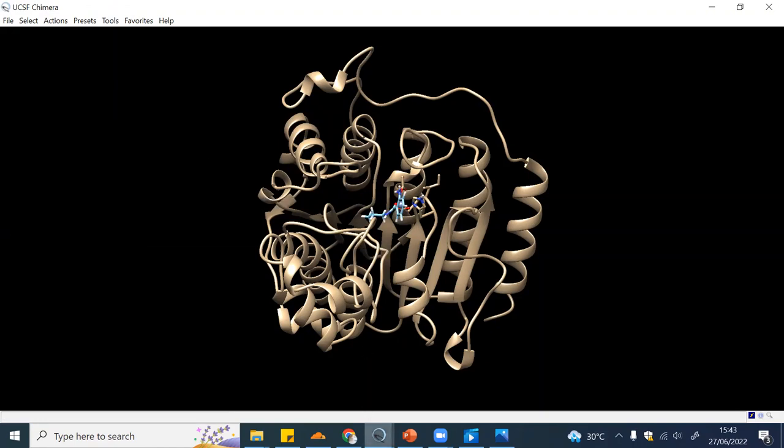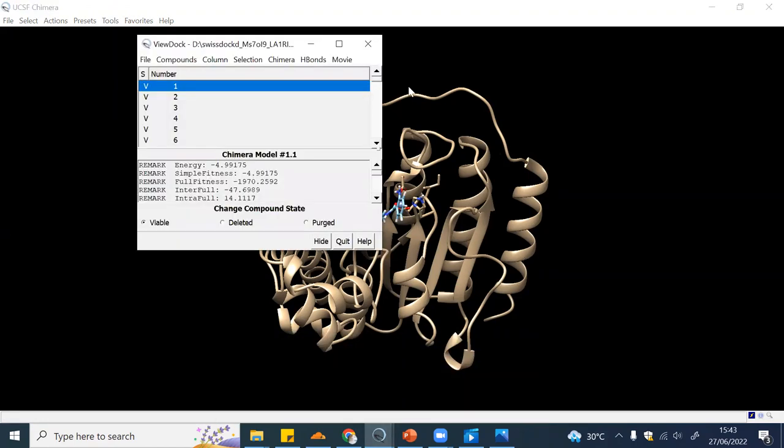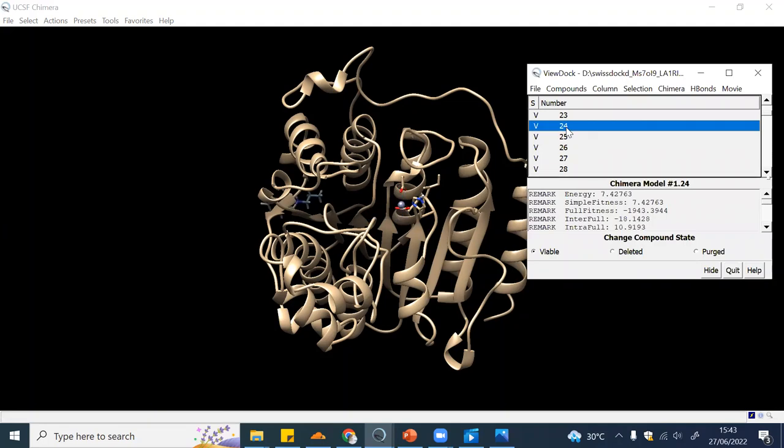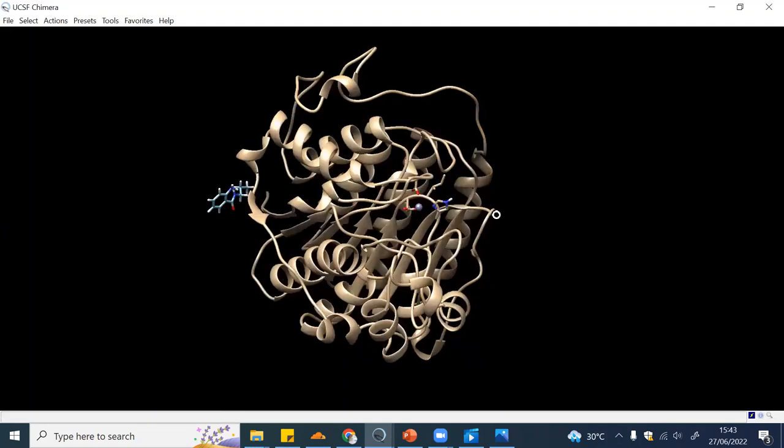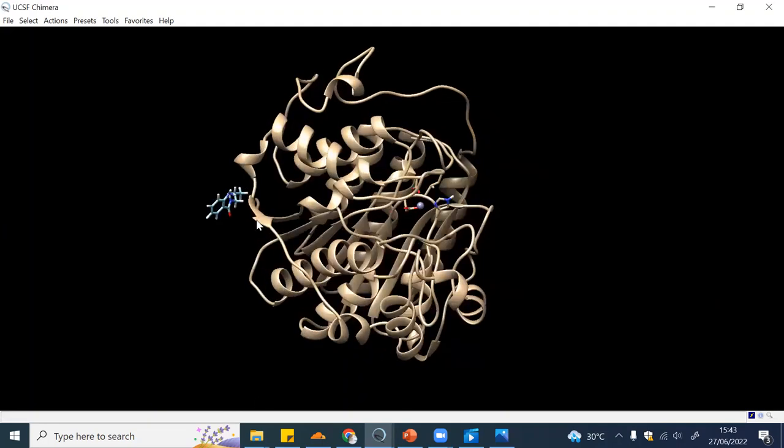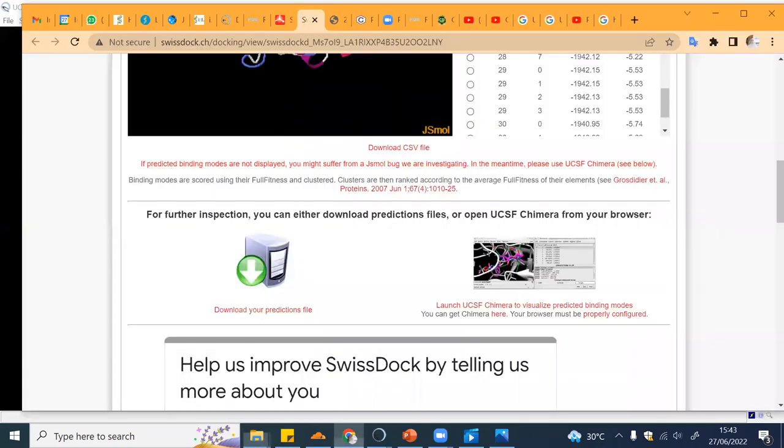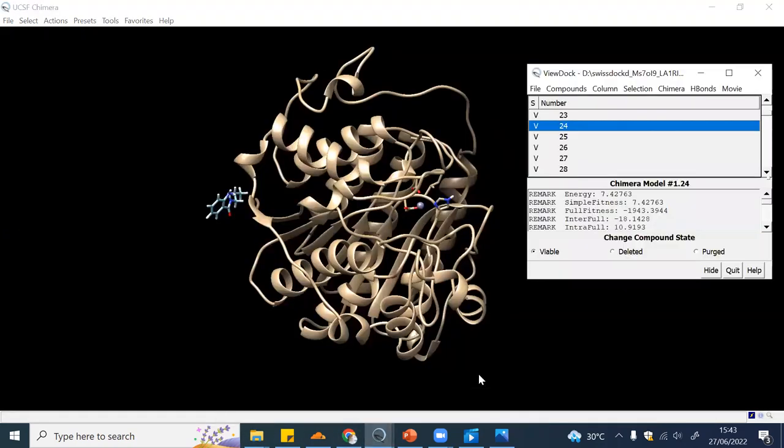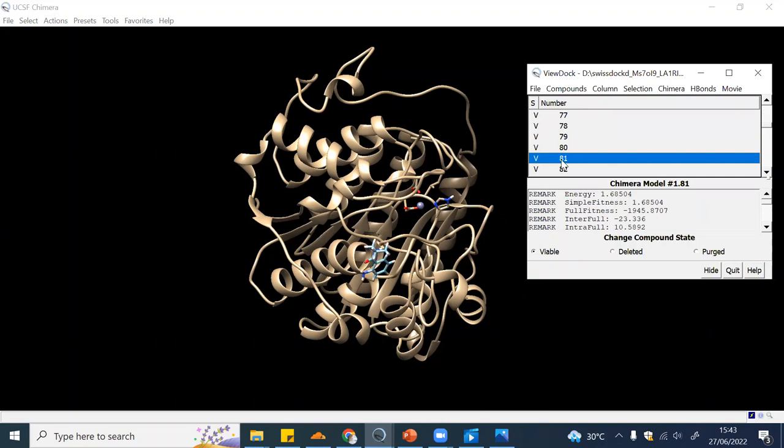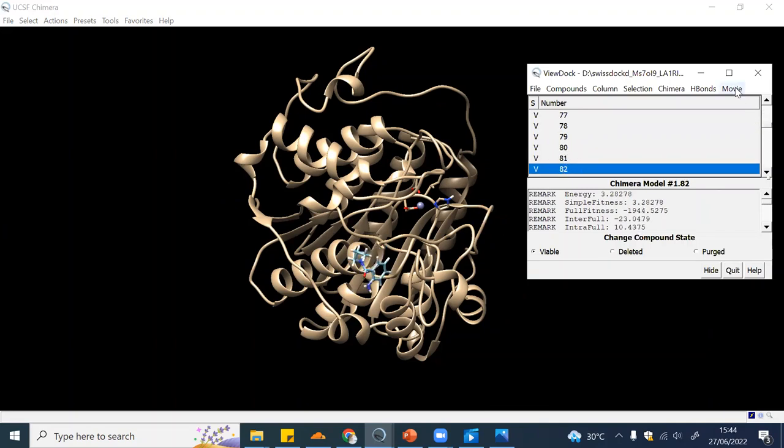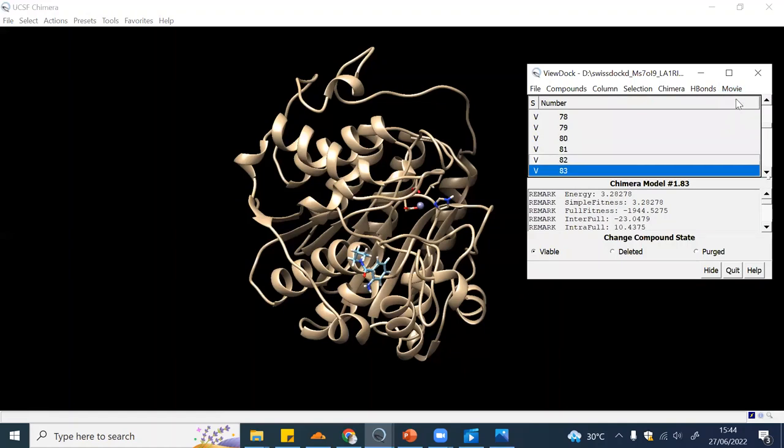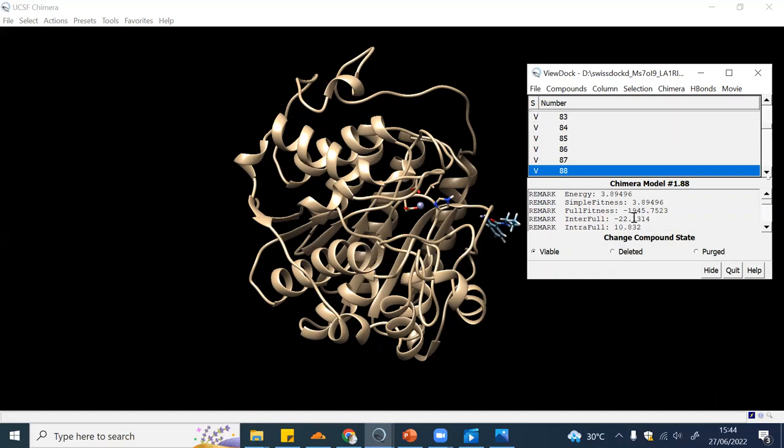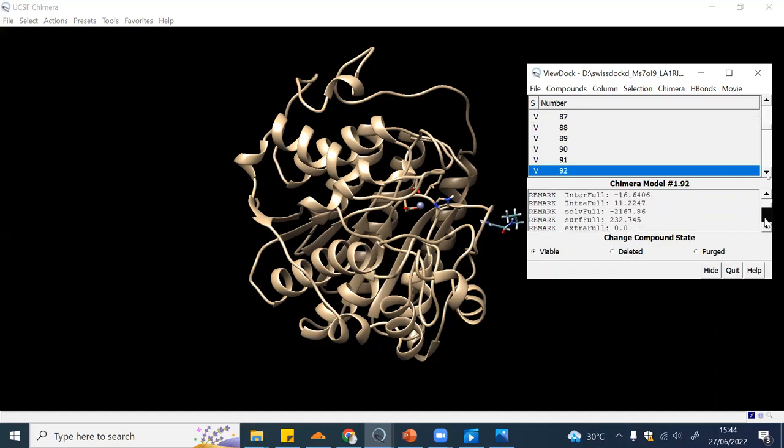This is the result of the docking. You have different results - for example this one is number one, this is number 24. It tried to find where this ligand can bind. You can see lots of positions with lots of conformations of the ligand. You can also put it in movie mode. You can see the energy, the full fitness, the parameters, and the results.